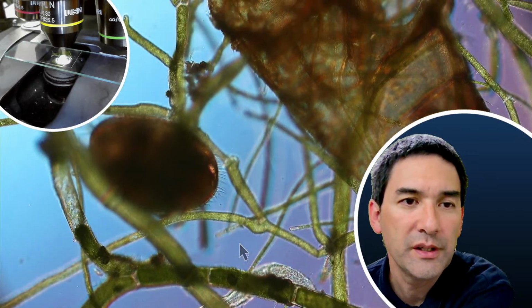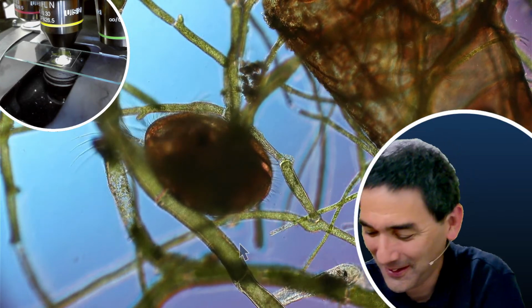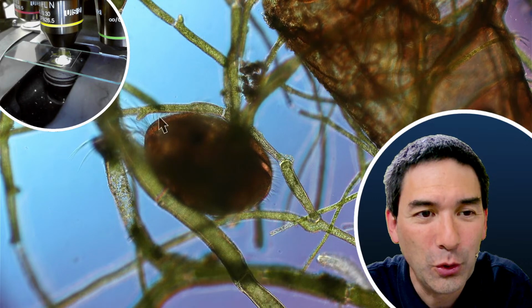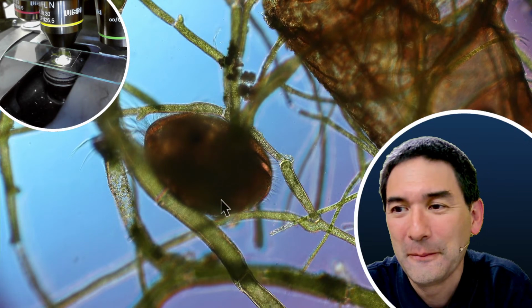This one over here, I think this specimen is more interesting than the other one. This here, of course, is a so-called ostracod. Here is a smaller one. The water crustaceans.